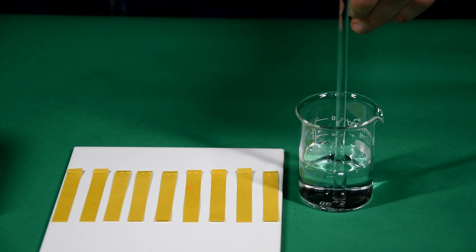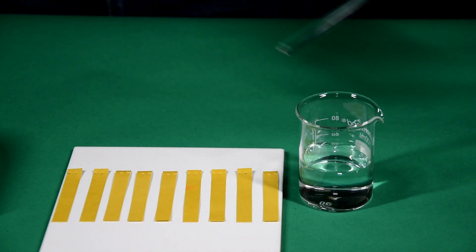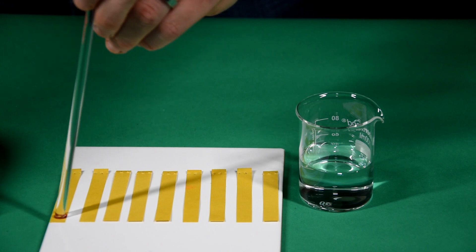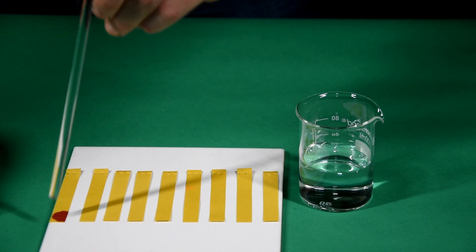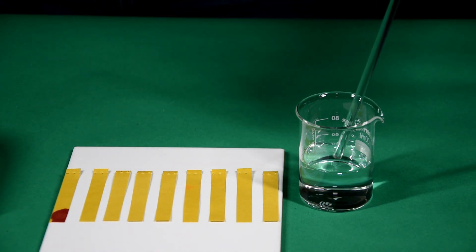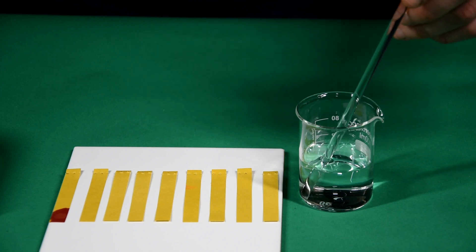We've laid out 9 pieces of universal indicator paper on a white tile. Then, using a glass rod, drop a sample of the acid onto the first sheet of universal indicator paper.